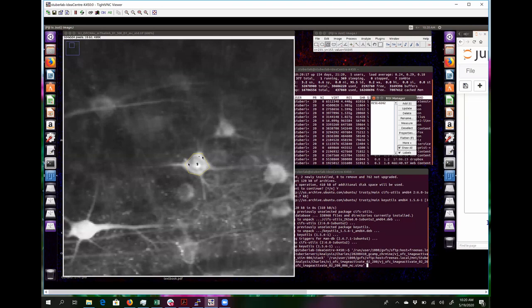So then about half of these pixels now become black. And they could be picking up, even though you can't see, other cells or processes in the kind of darker space. There still could be spurious signals in there. So there could absolutely be spurious signals there, but it's a darker space. So it would seem as if the cell actually stopped firing on an average, right? So on an average, if you look at the fluorescence, it will seem as if the cell just became quiescent.